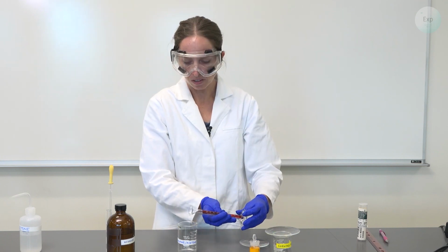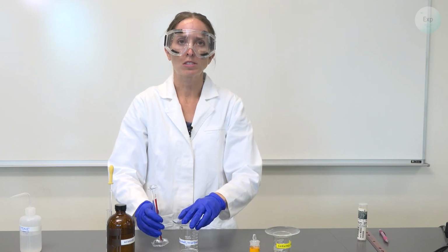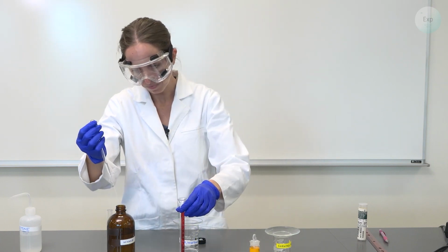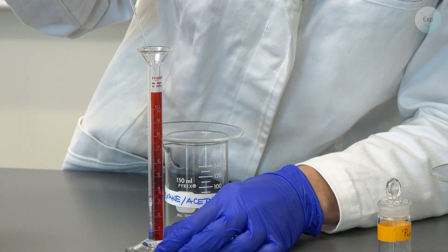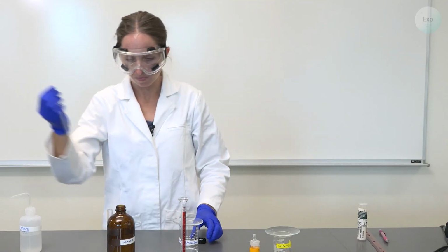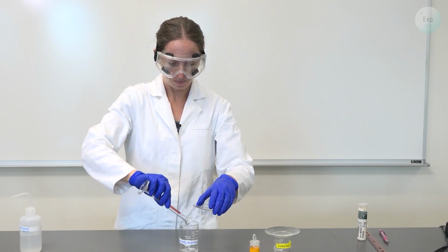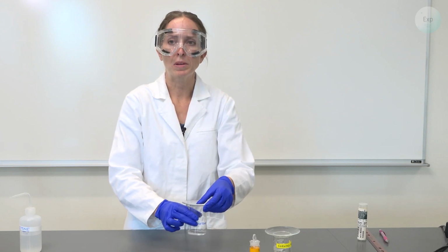I'm going to go ahead and put this in the beaker in which I will do the TLC. So I had 2 milliliters of acetone. To this, I am going to add 4 milliliters of hexane. So I will pour this in the beaker. I will swirl a bit to mix.